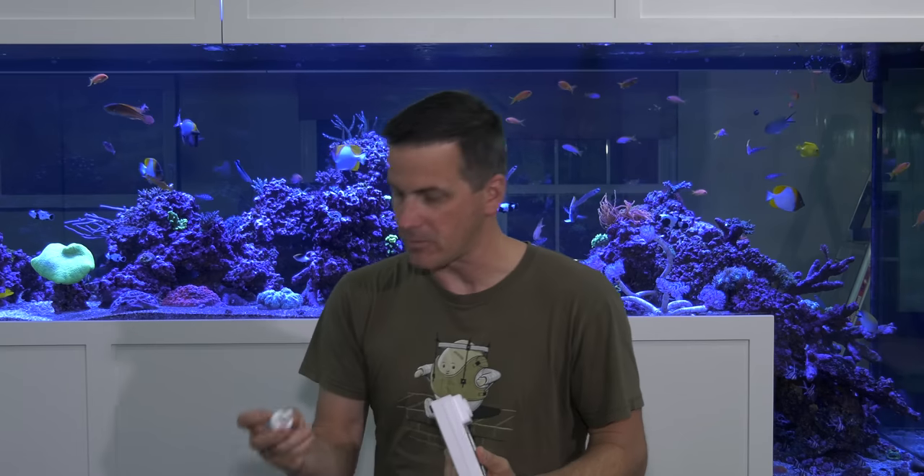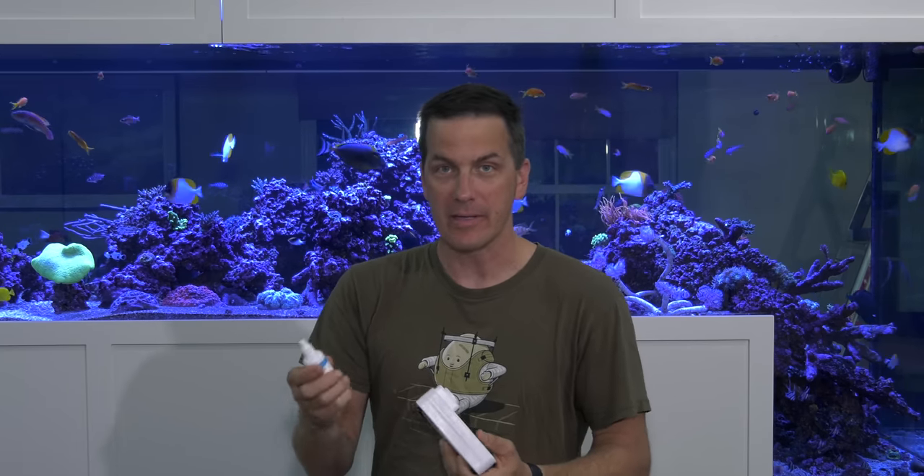A couple of thoughts looking over the footage. It's nice that it has on-screen tutorials. This thing tests seven or eight parameters, and unless you're running all those tests frequently, you're going to forget the steps needed for each parameter. Yes, there are instructions that come with this thing — notice they're still in plastic — but if you get that wet, lose it, or leave it behind, all you have to do is go into tutorial mode and it tells you exactly what to do. I like that it says go get pH reagent 780 — that way you're not left wondering which one it is. It gives you the number right on the screen to match the bottle, taking the guessing game out of it.